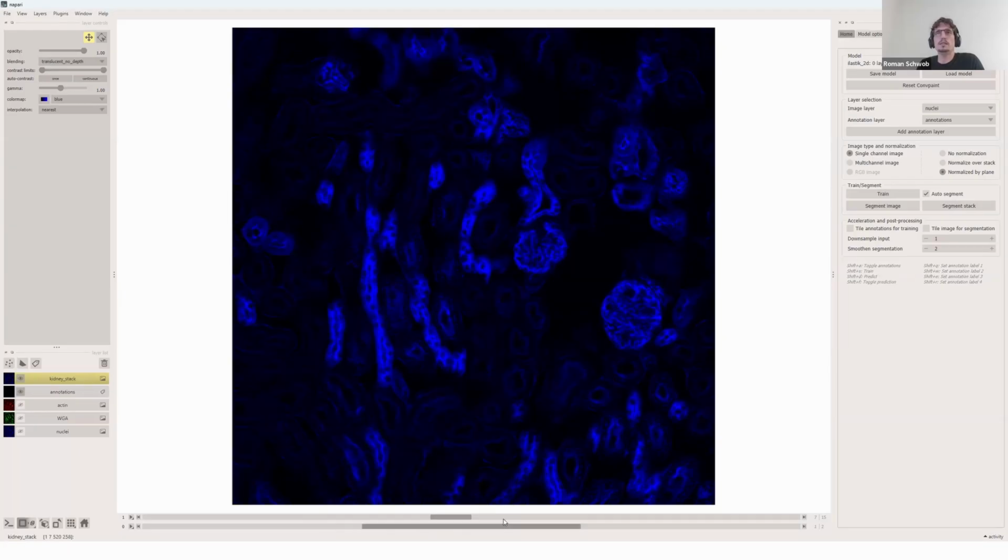And that's also fine, because inside Convpaint we are telling it: we have one axis in 3D and one axis is the channels. So Convpaint can handle it, but Napari doesn't know how to display it properly in different colors.